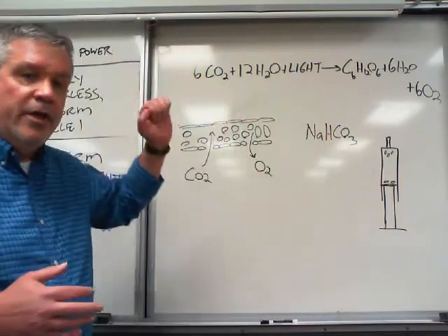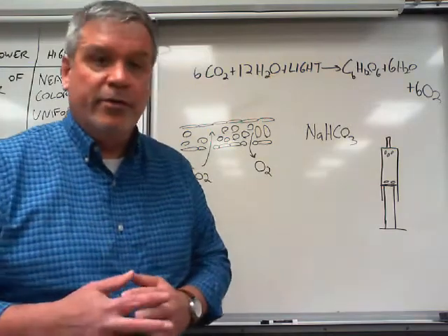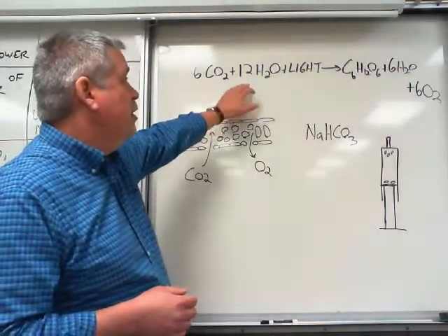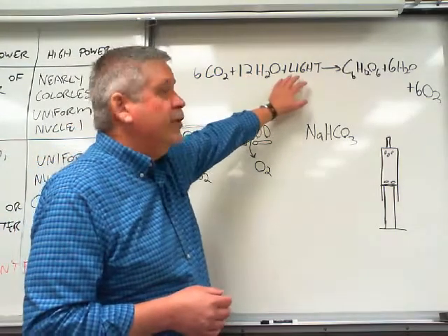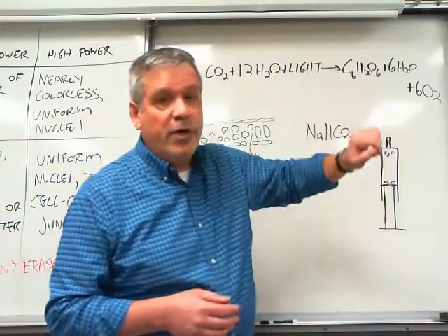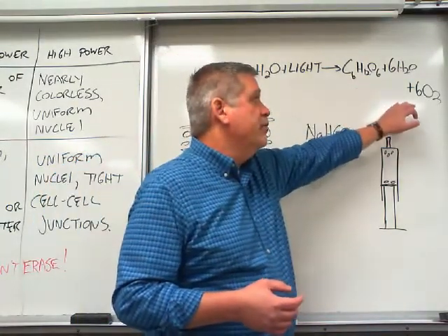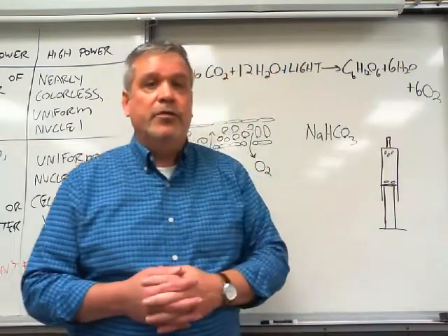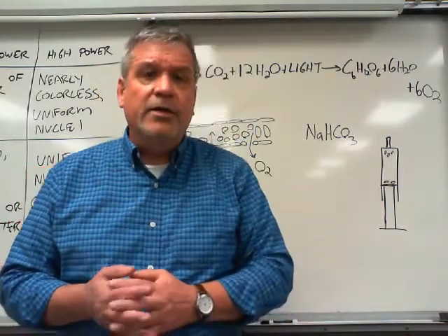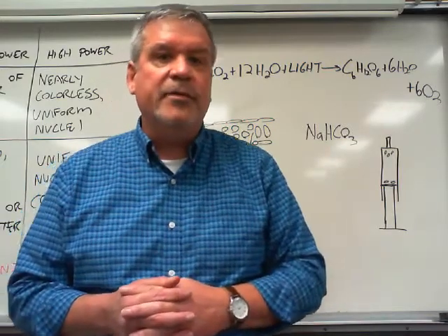So this formula at the top of the board is the net formula for photosynthesis. So we need 6 CO2 plus 12 H2O plus the energy from sunlight gives us C6H12O6, which is glucose, plus 6H2O plus 6O2. So we're going to be using a floating leaf disc assay using a type of plant called English ivy.